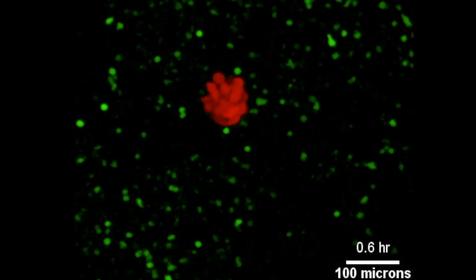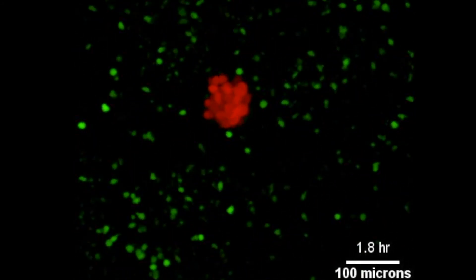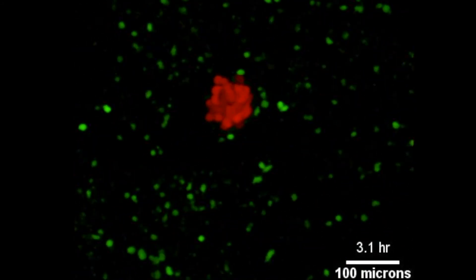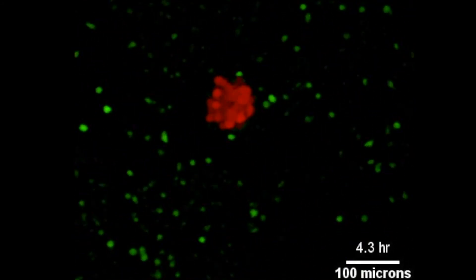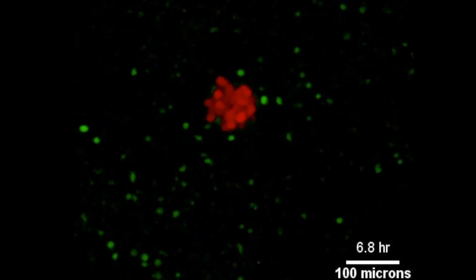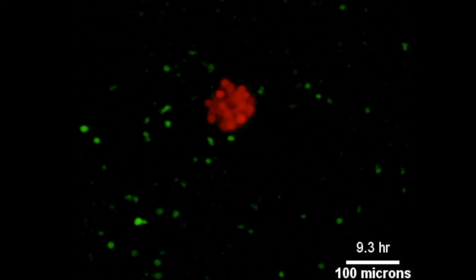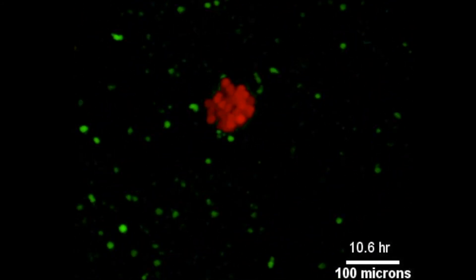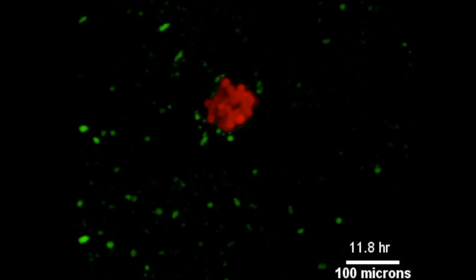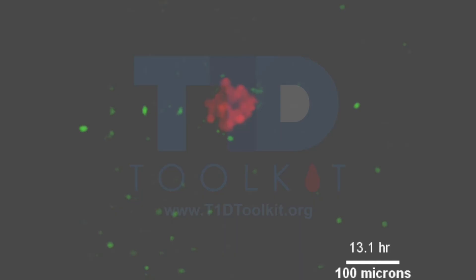So this is a way that you can model the destruction that happens in the human pancreas, because these are human beta cells and human T cells.